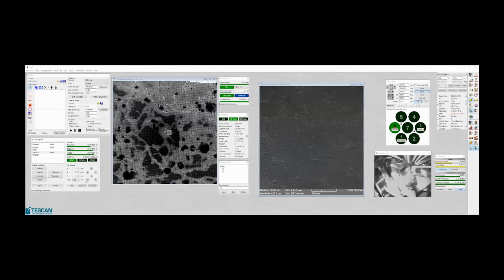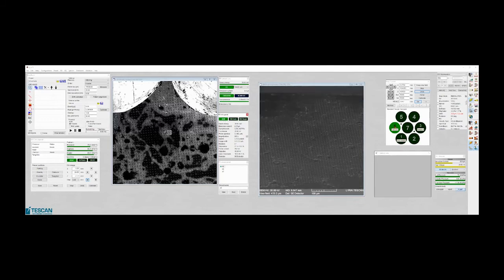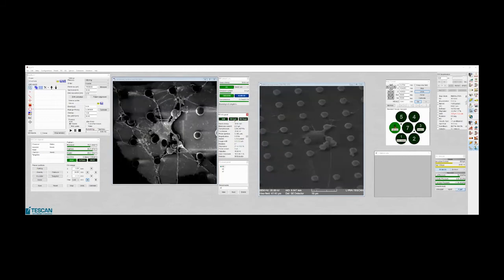So we have to come a bit closer. So here we are. This one on the right edge is the one which we would like to use. So we will go closer, and here we will put the protective layer on top of it.